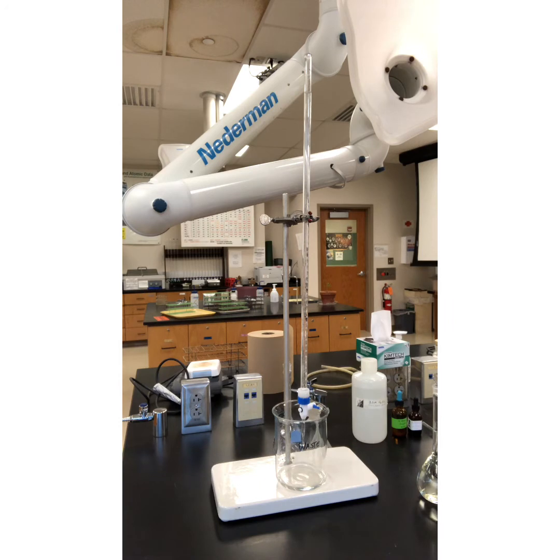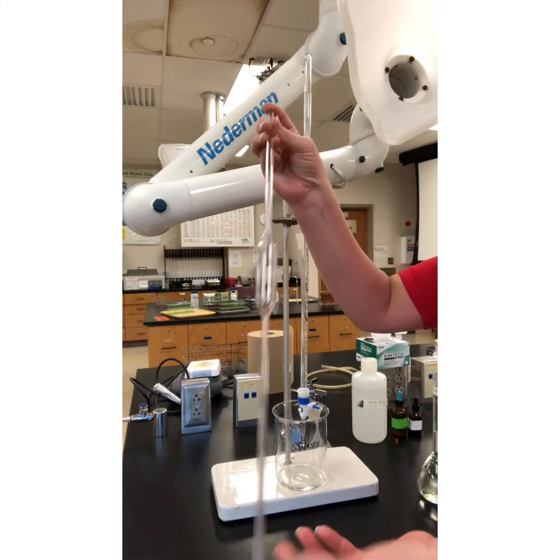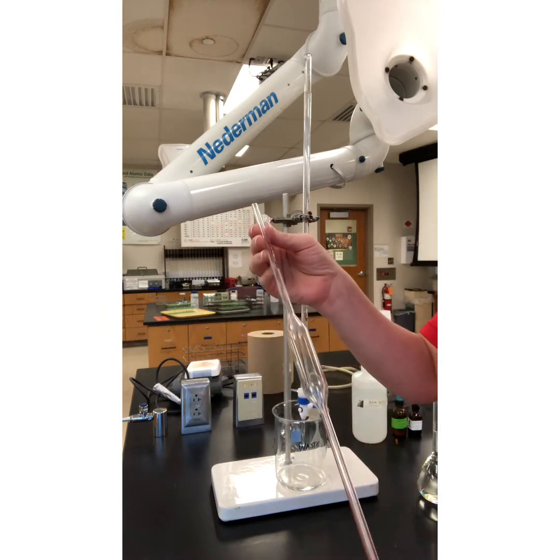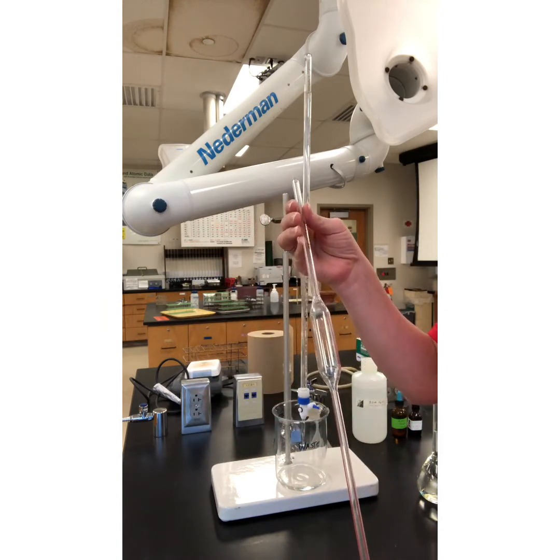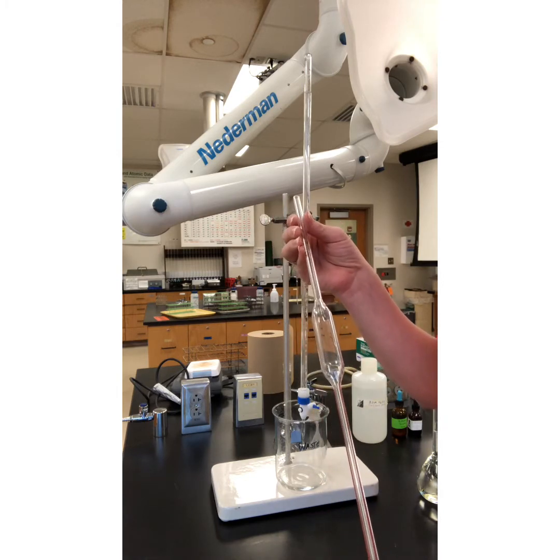Okay, let's see. So our pipette, again, is another piece of volumetric glassware designed to deliver the exact volume. So this guy is designed to deliver exactly 25.00 milliliters of your intended solution.